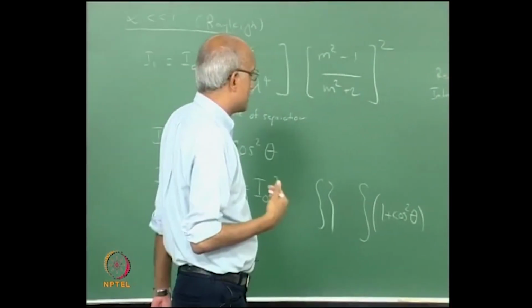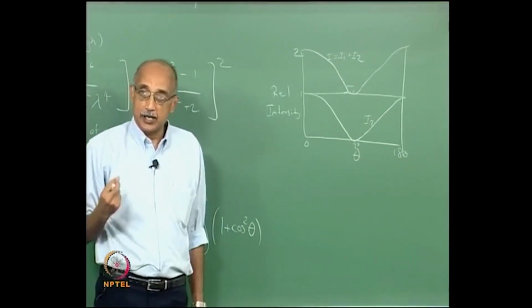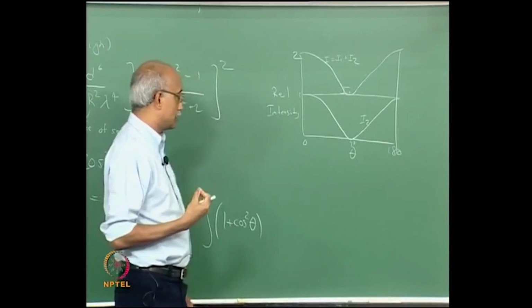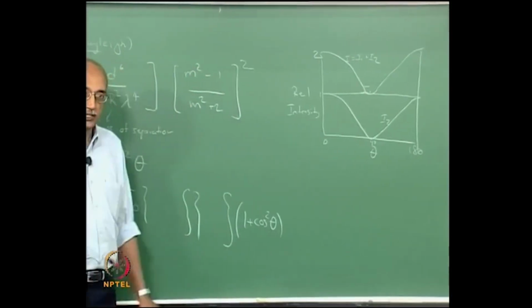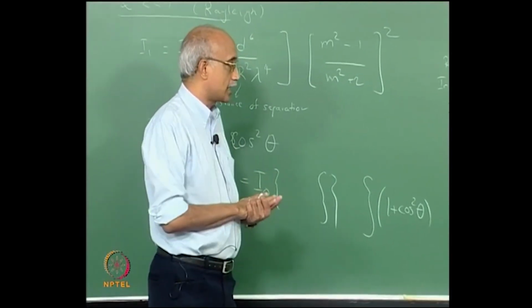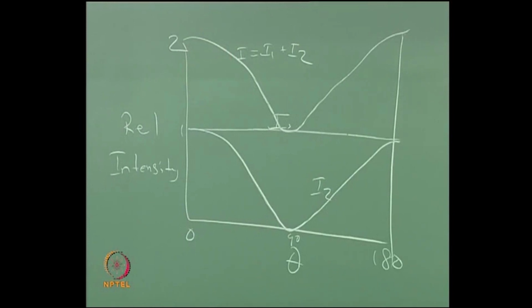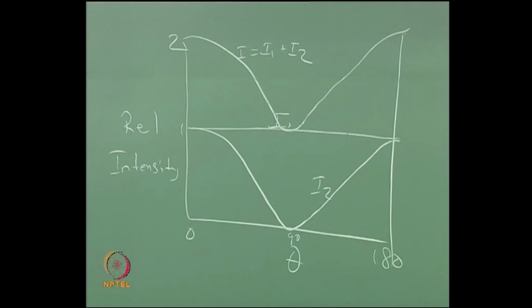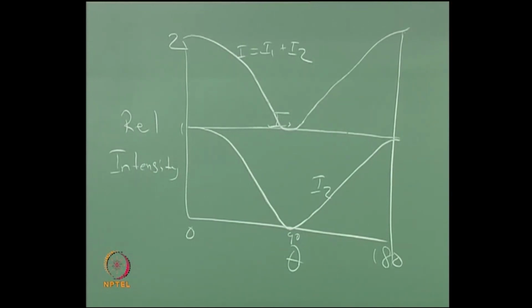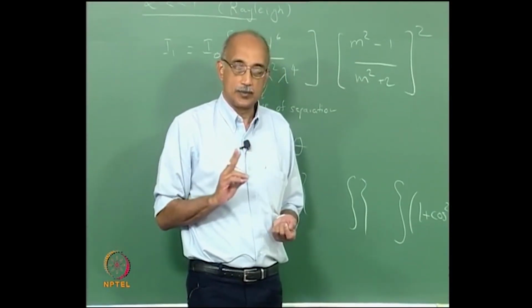So, if you are trying to measure scattered light intensity from a spherical particle that is in the Rayleigh scattering regime, you can see that the dependencies are very well established. The expected relationship between scattering angle theta and the scattering intensity is also well established, predicted, and it can be measured and validated as well. So, particle size measurement in the Rayleigh regime is actually the easiest to accomplish.